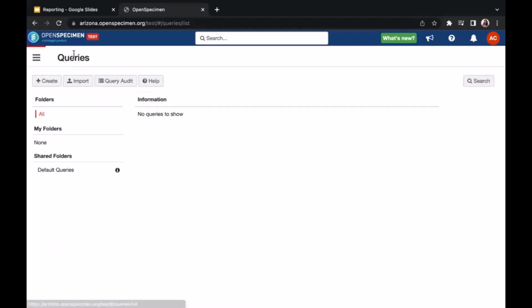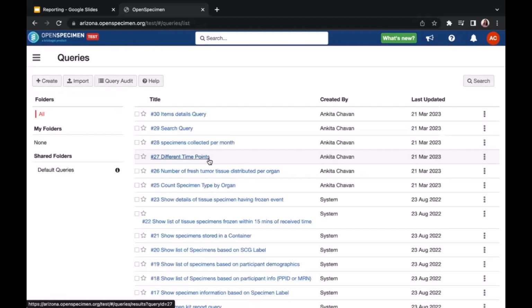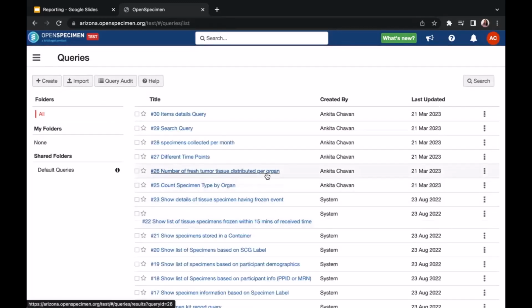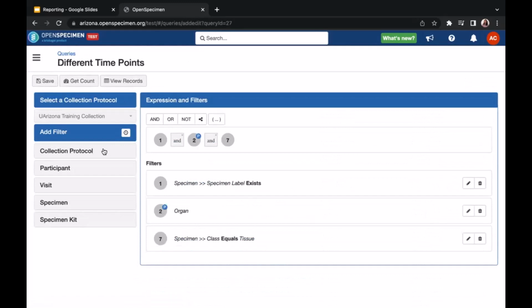Okay. So for ease of the training, I have already created a query. Let me open the, sorry. Yeah. So as I mentioned, I have selected my collection protocol here.